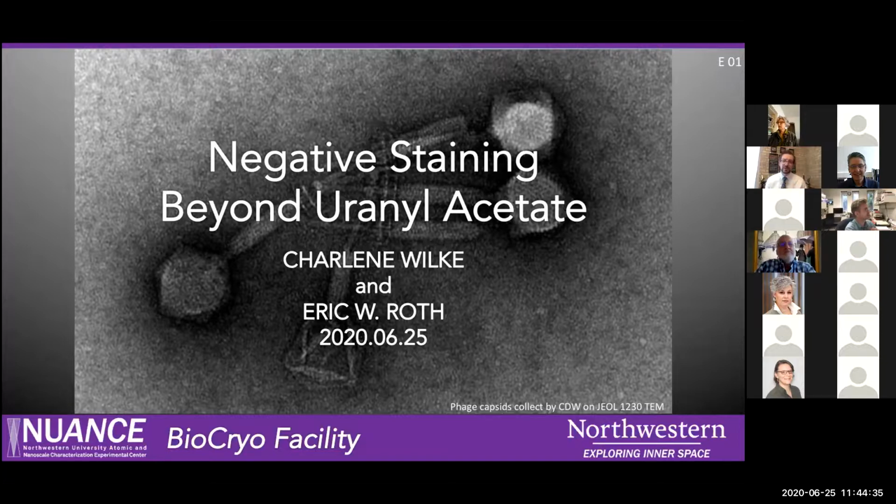We share that hood with Cubic. So really there's minimal usage in there. If you're doing negative stain, hopefully you're using 5-6 microliters at a time, so really minimal volume of waste.